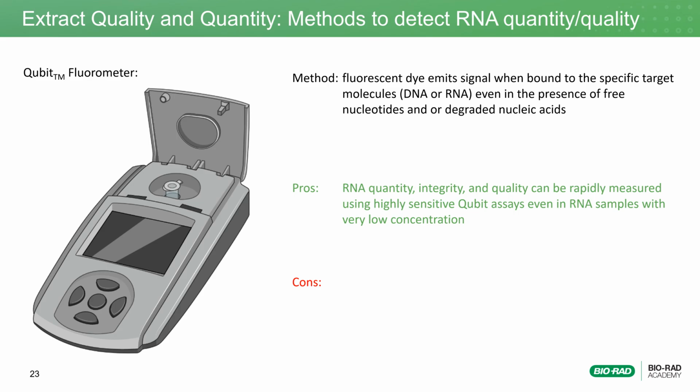The RNA IQ number is based on a scale of 1 to 10, like other RNA quality scores, wherein a high IQ number indicates most of the sample consists of large and structured RNA. Conversely, a small IQ number indicates the sample comprises mainly of small RNA with limited tertiary structure. If your lab has access to this instrument, I strongly recommend this method as it represents the most accurate and efficient technique to validate your RNA extracts.